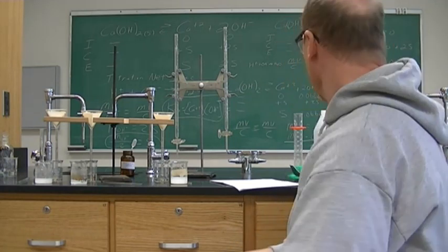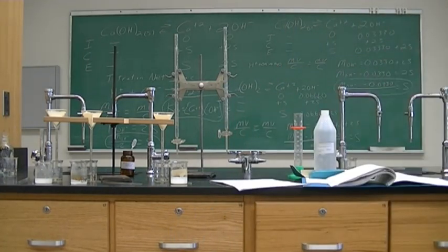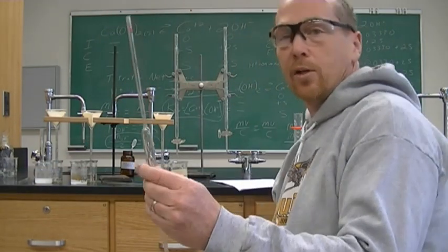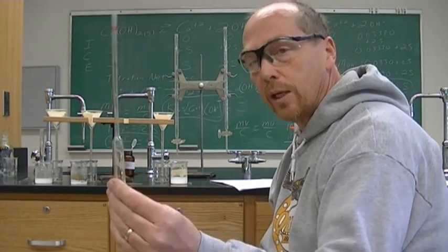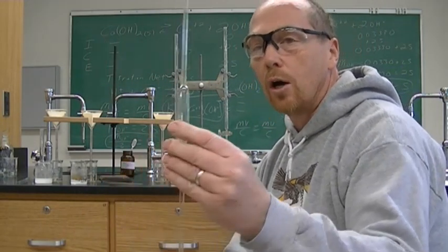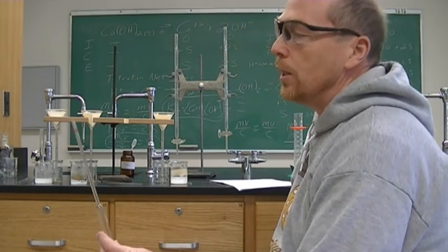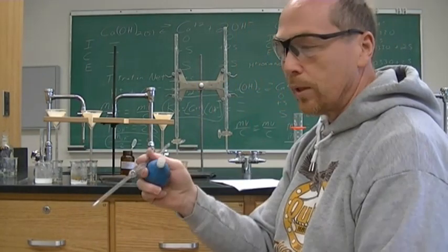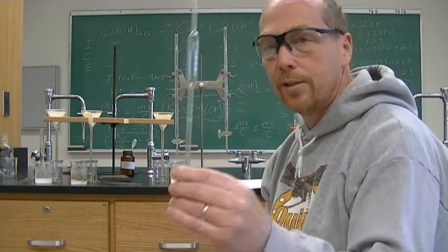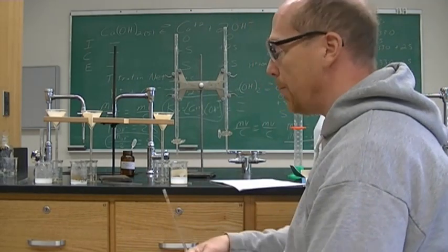All right, so I'm going to get a pipette. All right, so here's a pipette. Another reason why we would use a burette. You don't have to use a pipette, but I'm doing it. Pipettes are much more difficult, especially the antique pipettes. All right, so we are going to learn the technique of pipetting and then I'm going to use the burette, and you'll see why. A burette is much easier to use than a pipette.